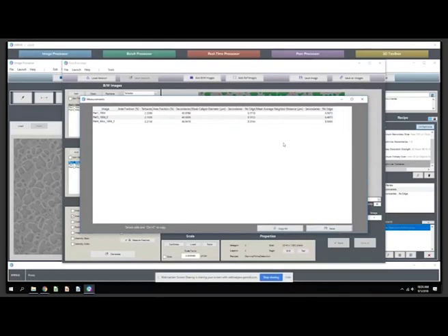So that was a quick run through on the solution that we put together for NASA in about a day's time. And we're very pleased with the collaboration and the paper that they produced with us. And we're really looking forward to helping the rest of the SuperAlloy community adopt this as a new standard. So with that, I'm going to turn it over to Pavel, and he's going to take you through the life science case study.